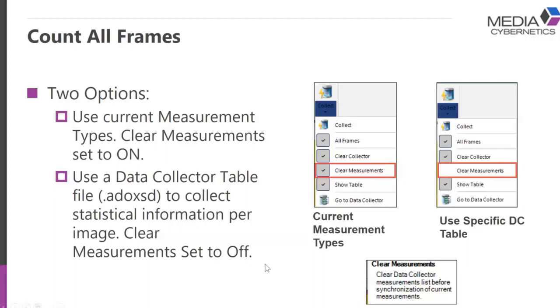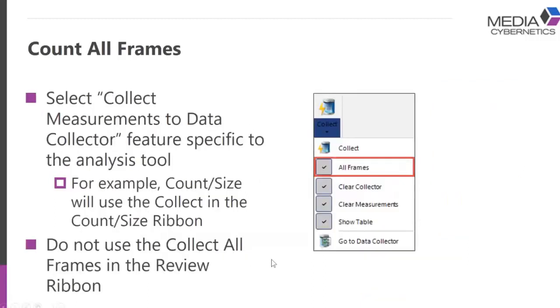Again, I'm going to go through this live so you can see it in both fashions. Again, this is primarily the same workflow that we've done. One important thing, once we have this set up and you're ready to go, you'll simply press the count button or the collect button. Either one is the same. It's just how you have the preferences set.